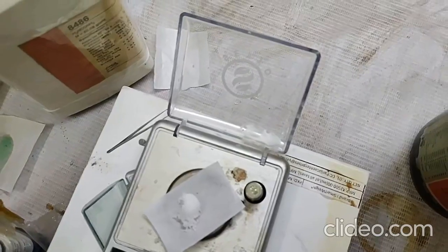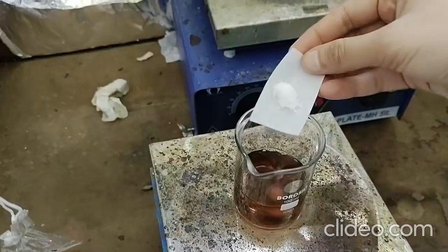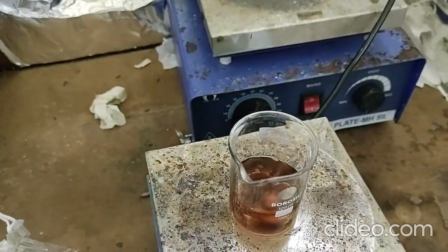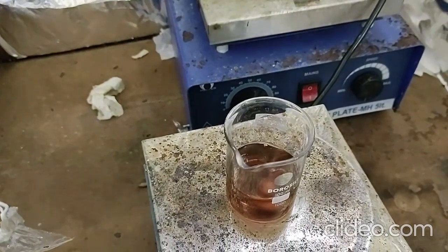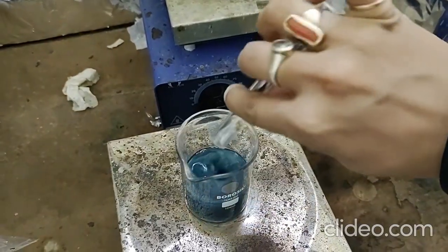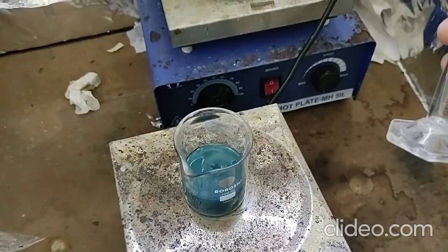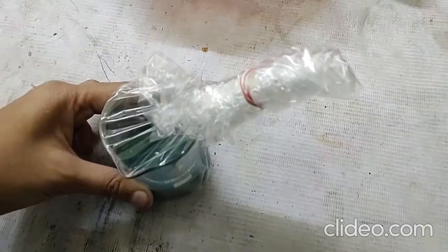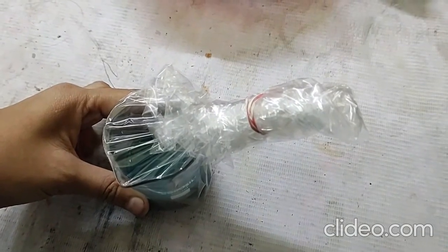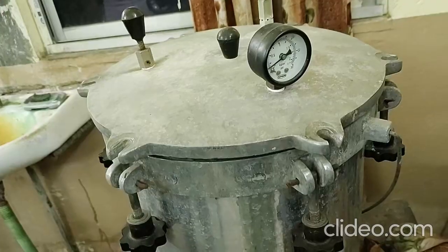After 1 hour, 1.2 gram urea is weighed and added to the solution. And then it is kept stirring for another 2 hours. Next, a few drops of ammonia are added to the solution to change the pH of the solution, and the color of the solution has also changed. After 2 hours, the beaker is tightly sealed with a plastic so that no vapor can enter into it. This is the autoclave.